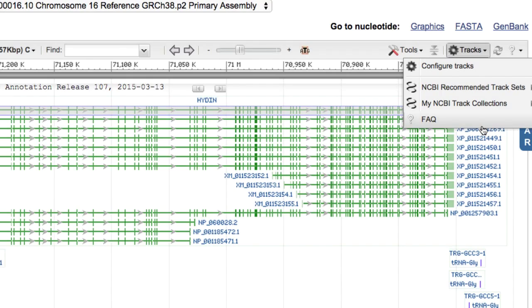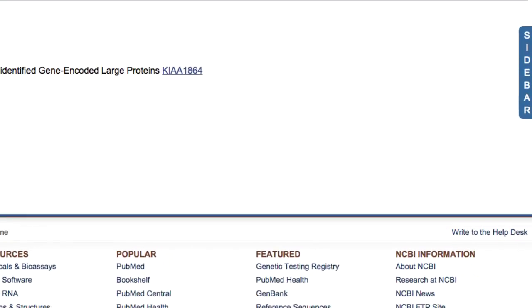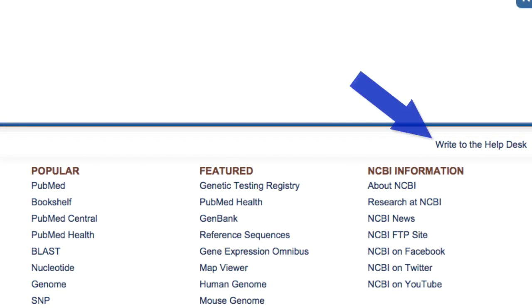For more information on track sets, click the FAQ link at the bottom of the Tracks menu, or contact the NCBI Help Desk.